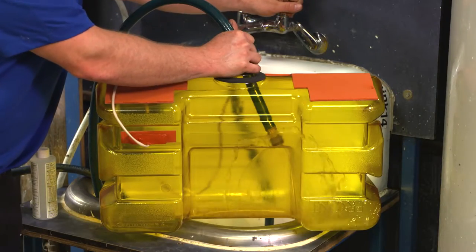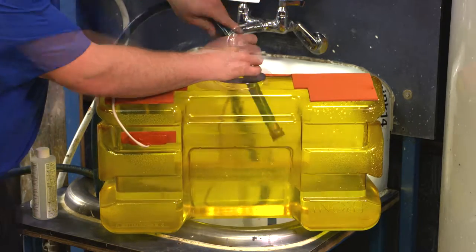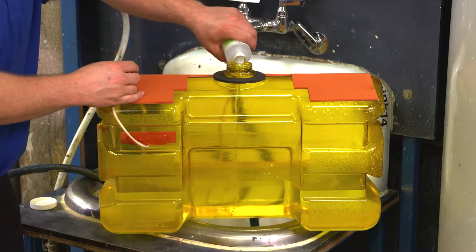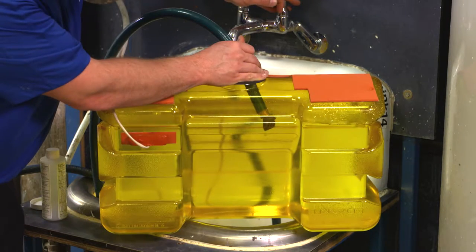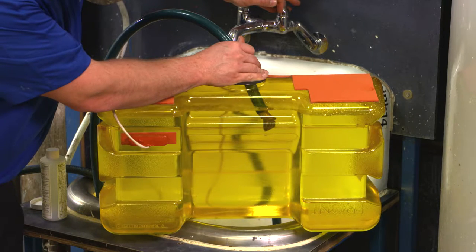Pour clean, potable, tepid water into the tank until it is one-half to one-third full. Next, add water preservative solution if desired. The preservative extends the life of the water in the tank but is not included. Follow manufacturer's instructions on when to change out the water if you are using a preservative. Continue to add water past the required fill line; the extra water will be dispensed during testing.